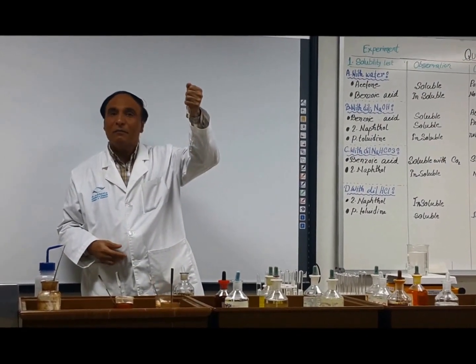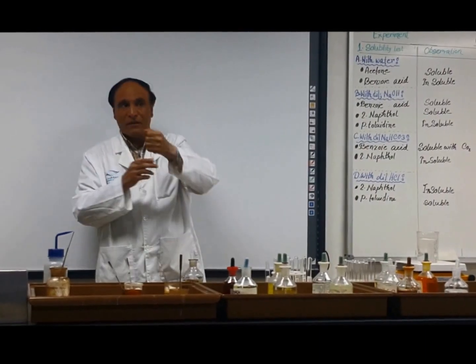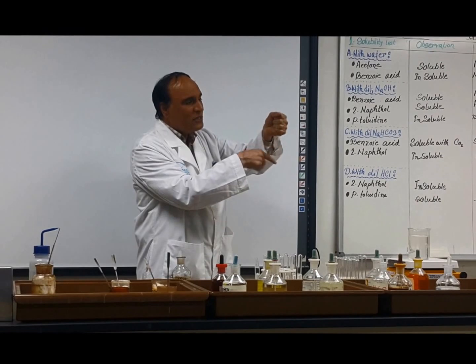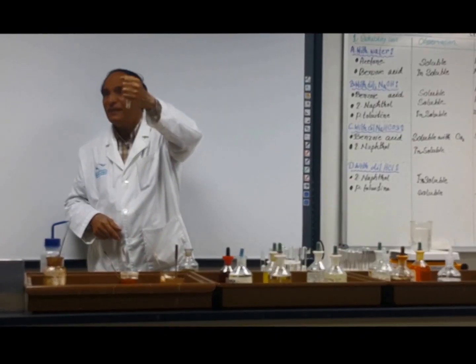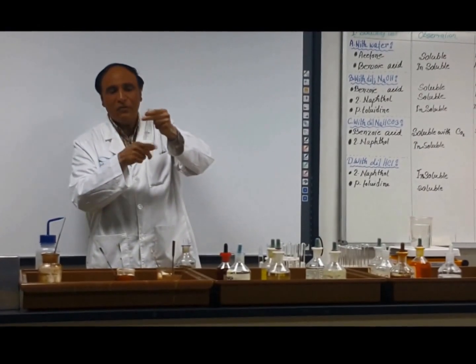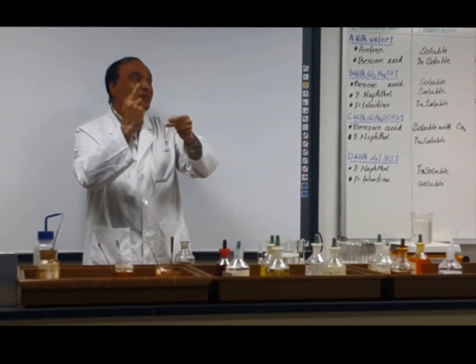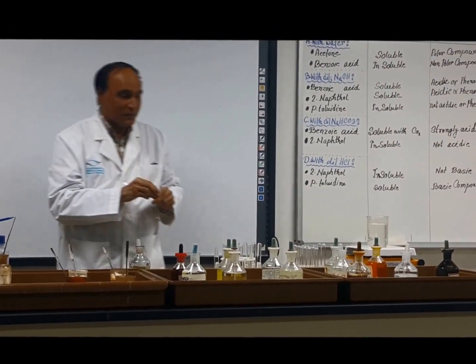There is no problem, but not the scientific way. You must hold it in that way. You can shake it like this, but not scientific way. You will hold it and move it, it will move like that, so it will dissolve easily, quickly. You see that one?